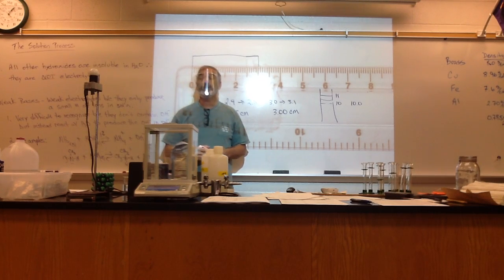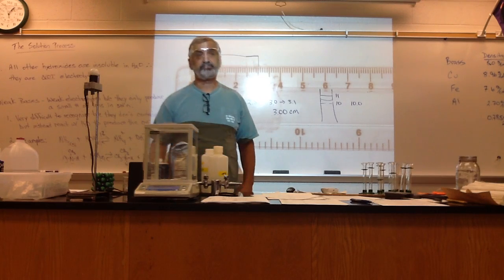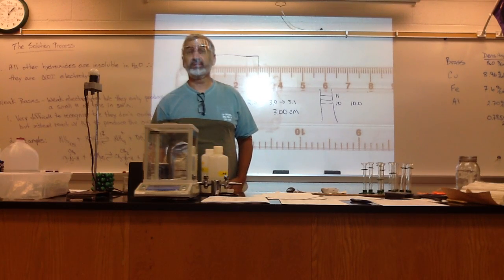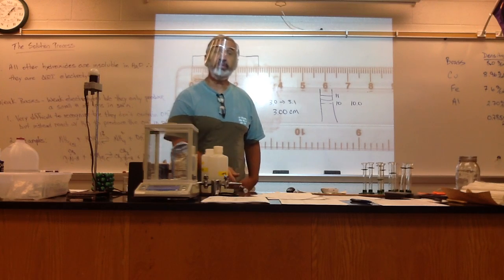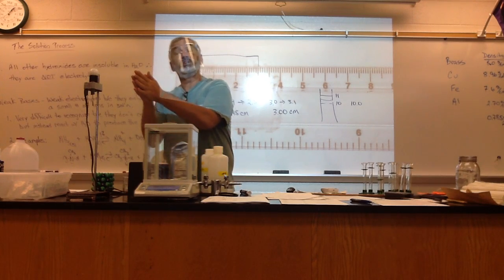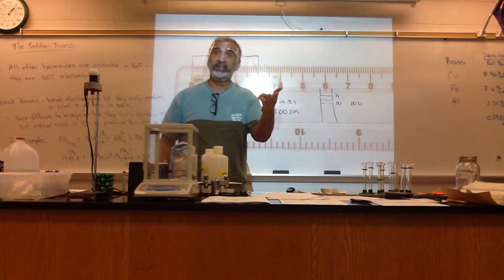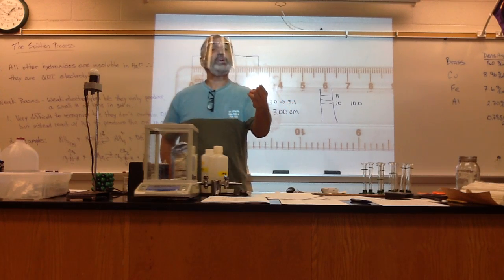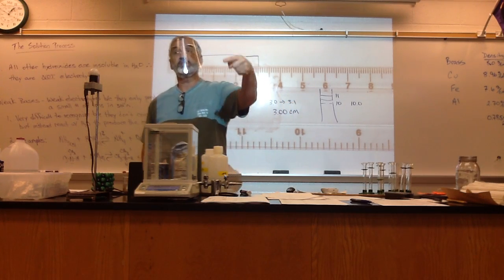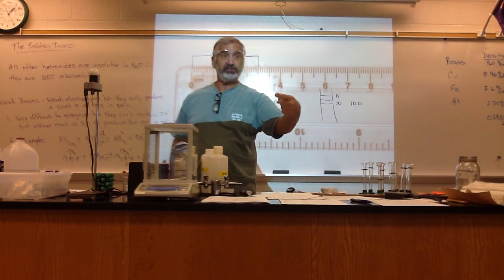Look at your small glass graduated cylinder. What's the smallest unit on that one? Tenths, right? So what do we measure to? To the 100ths. So when you're recording your volumes, and we're going to measure with a ruler length times width and height, you need to make sure you record to the proper degree of accuracy. Then when we record the volume by water displacement, record everything in your data to the proper degree of accuracy, what we just talked about.